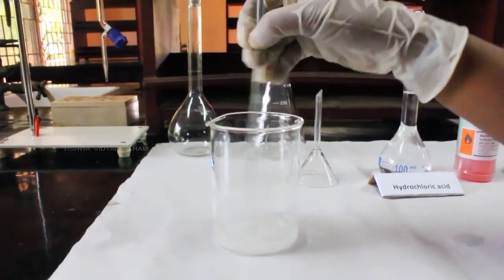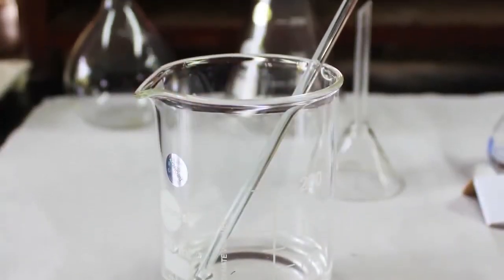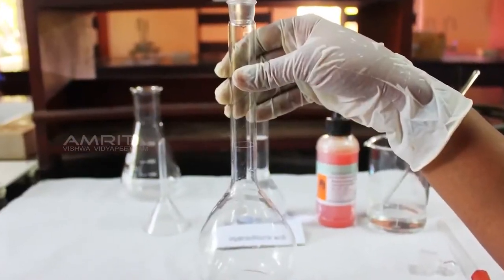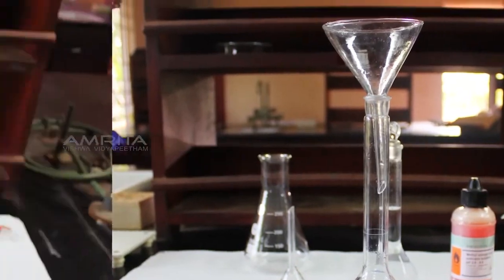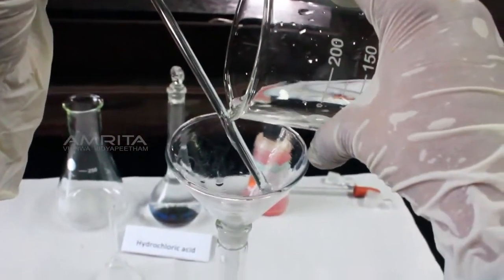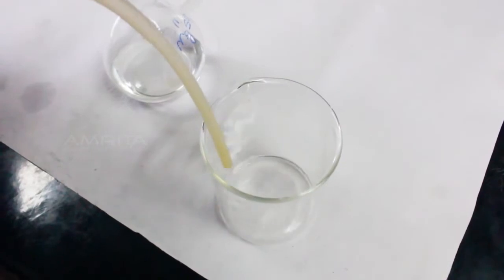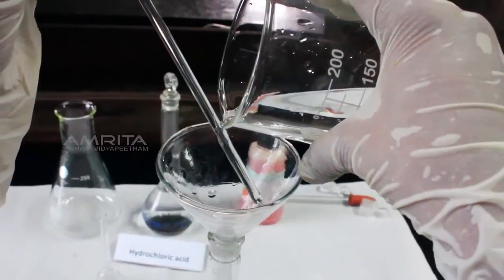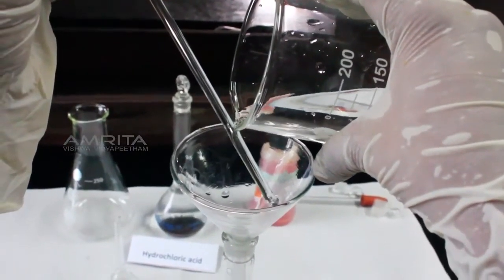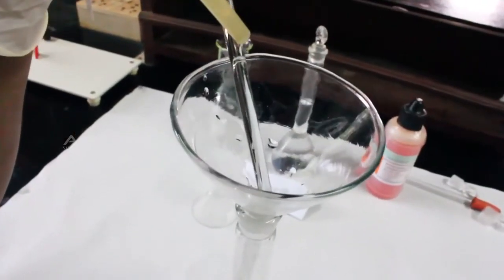Dissolve sodium carbonate crystals in the beaker by gently stirring with a clean glass rod. Take a 250 ml standard flask and place a funnel over the flask. Place a glass rod over the funnel and transfer the entire solution from the beaker into the standard flask through the glass rod. Wash the beaker 2 to 3 times with distilled water to transfer the solution sticking to the beaker into the standard flask. Then wash the glass rod with distilled water.